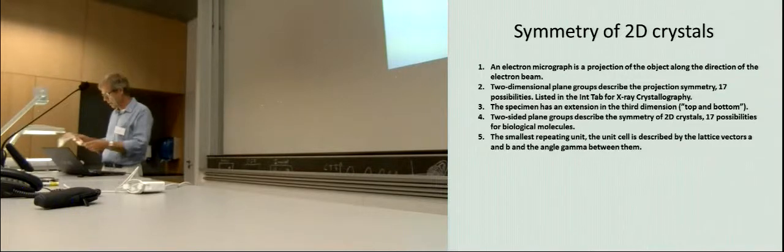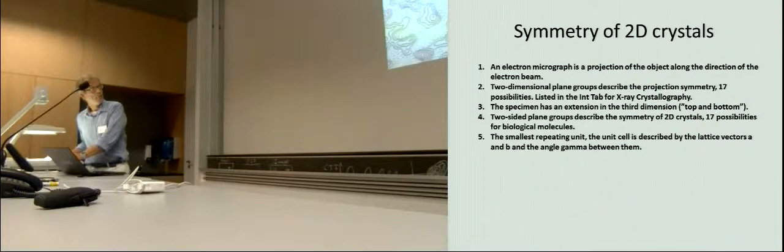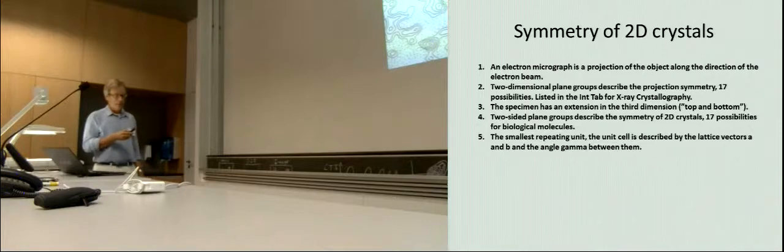So I also have this here, which is the same protein, but it's a different crystal form. So this is a hexagonal crystal form. So this is the protein again. So in this case, there are only 2 protein units in the unit cell.